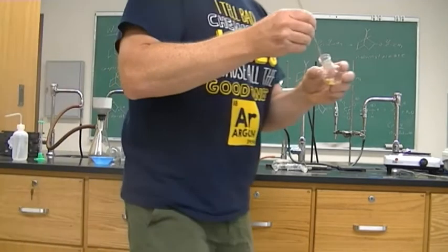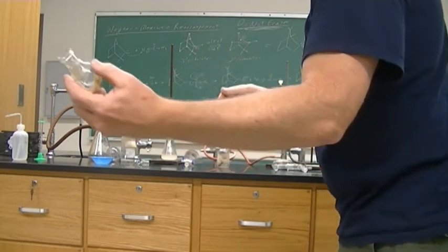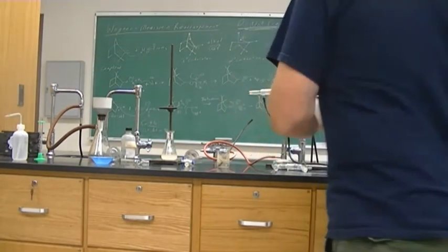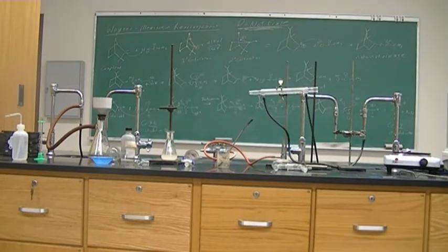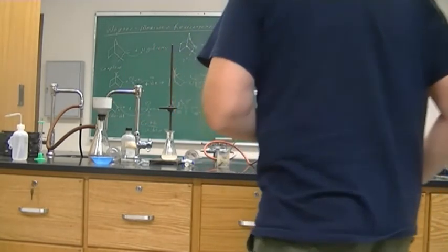So if we calculate our theoretical yield and our actual yield, and we get over 100%, it's because we didn't wait for that to dry long enough. Let's see what we have. We have 38.7585. All right, so that's about 1.7 grams. When you do that subtraction, you're gonna get your 1.7 or so grams. We're gonna use all of that for the next step.